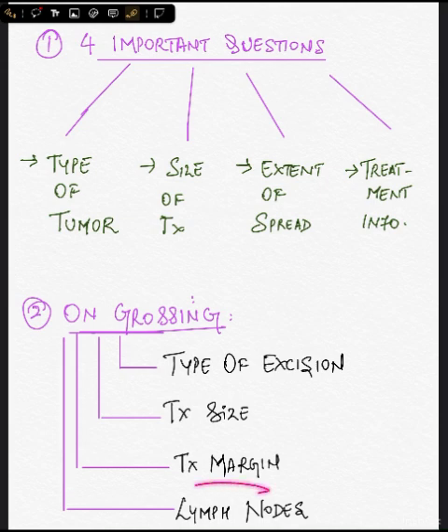And then we must also assess the lymph node involvement of the particular breast carcinoma specimen. We can do it grossly when the surgeon has sent the axillary lymph nodes along with the breast carcinoma specimen. Now, all these points will be elaborated in the further sections.